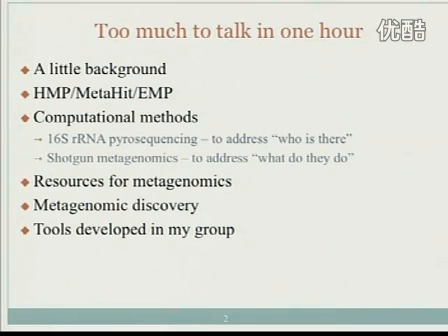Whenever we talk about methods, you need to know what you care about in a whole community of microbial organisms. If you only care about what those organisms are, so it's E. coli, it's streptococcus, so you just want the taxonomic information from the metagenomic data set, probably you will do different experiments. You will only get 16S RNA gene fragments from those samples, and then you will analyze those fragments.